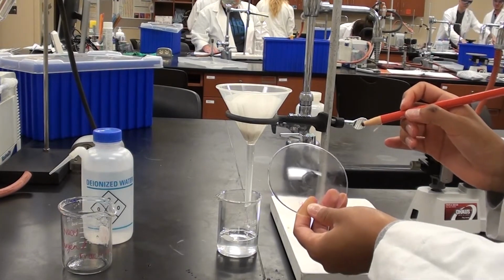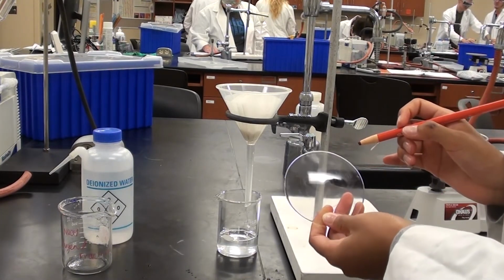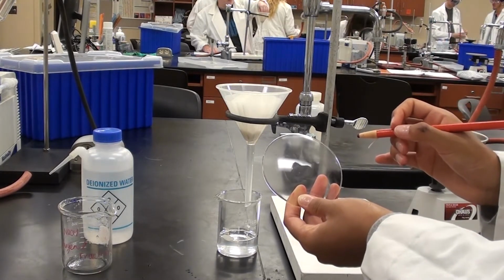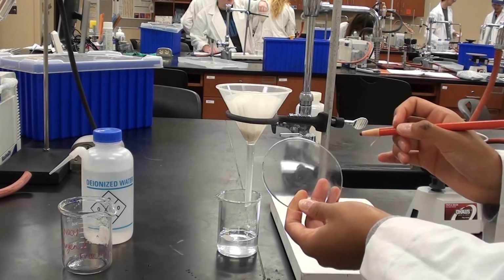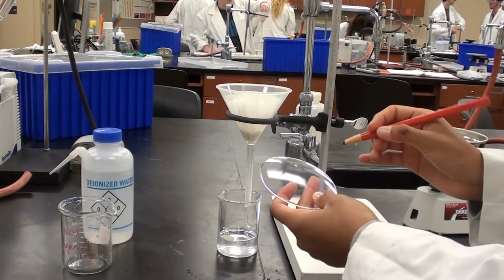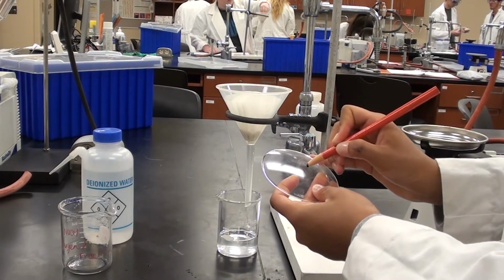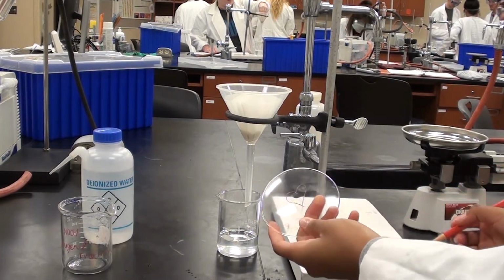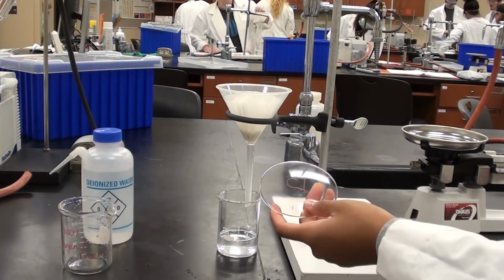Now Sabrine is going to draw some sort of identifying mark on her watch glass so that when she puts it in the oven, she can distinguish it from everybody else's. Go ahead and draw an identifying mark. Oh, is that pretty or what? It's a heart. That is so nice, Sabrine.